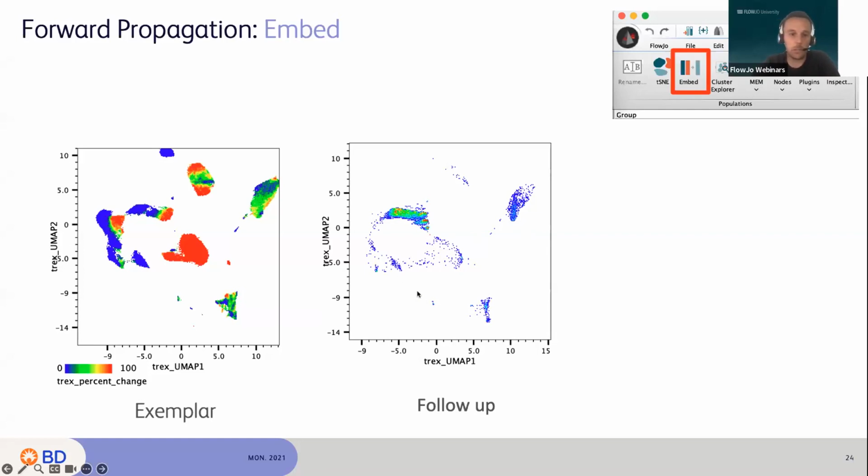I can really see that in this new set I have those clusters present, but I'm missing the one here on top, and mostly this one as well. So it really helps you redo the analysis and put yourself in the same space.